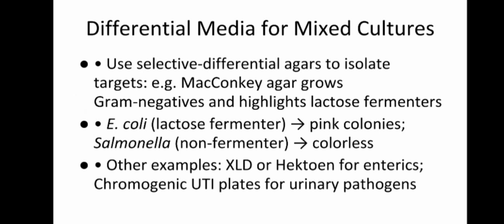So when you use selective differential agars to isolate targets, if you want gram negative, use MacConkey, or if you want specifically gram positive, you use a high salt agar. Okay.